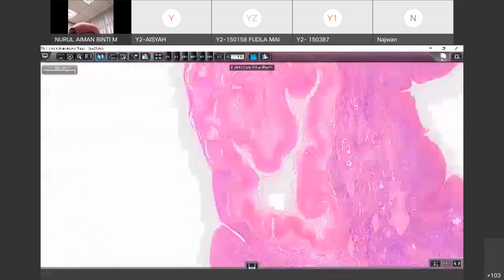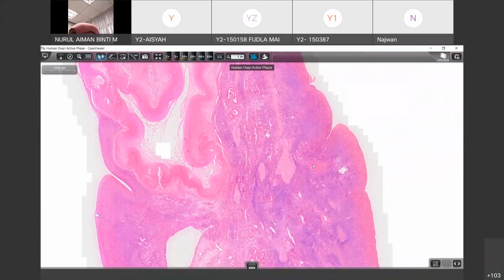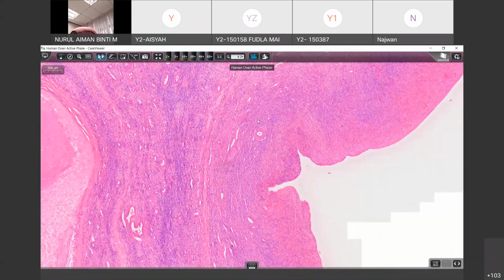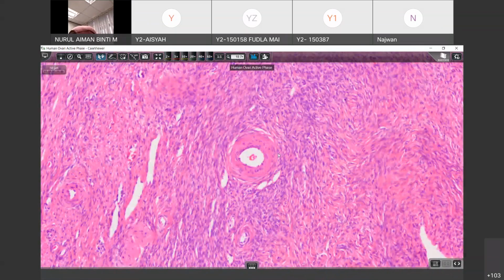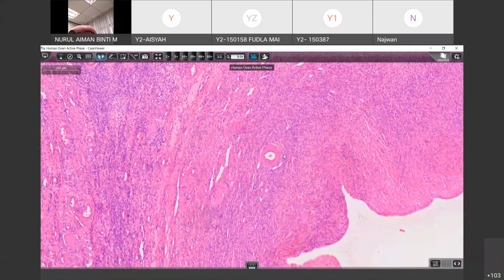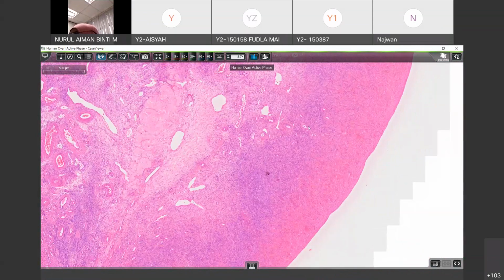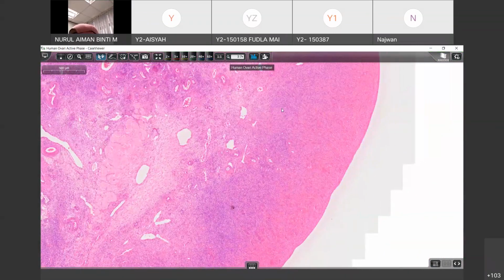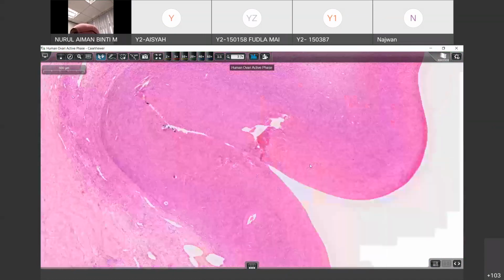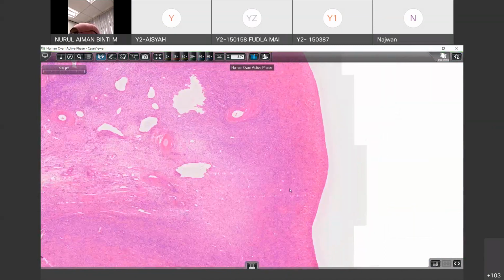Okay, all right, so go towards this other side. Try to find if you can find another. Yeah, this is, no, this is not. This is blood vessels. Sometimes the blood vessels also look confusing because they look like the primary or primordial follicles. So you can't find a lot of primordial follicles here.